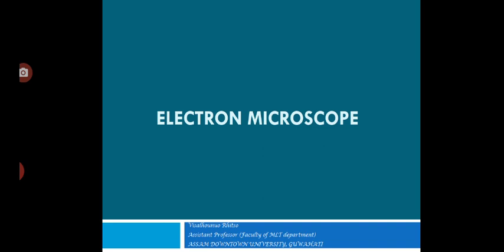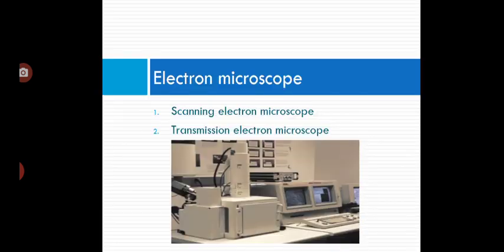light microscope. Shadow casting is an important technique in electron microscopy. This is achieved by depositing a thin layer of metal on the object. Such a metal-coated object held in the path of the beam scatters the electrons and produces an image which is focused on a fluorescent viewing screen. There are two types of electron microscope: a scanning electron microscope and transmission electron microscope.